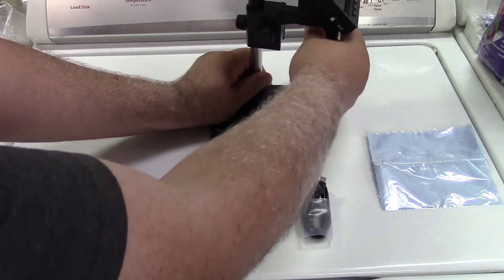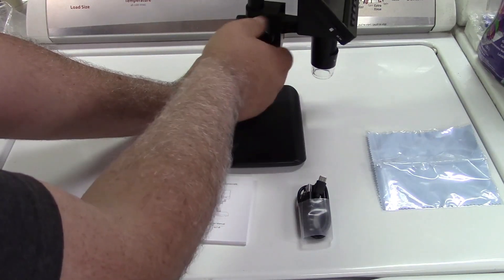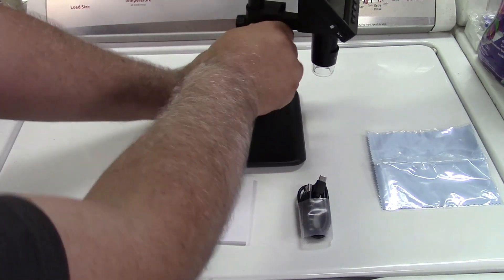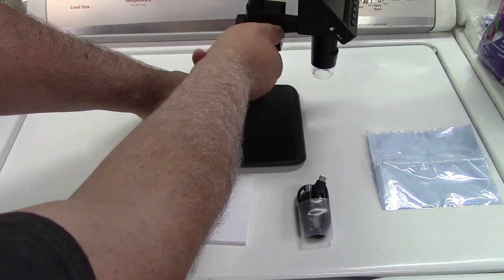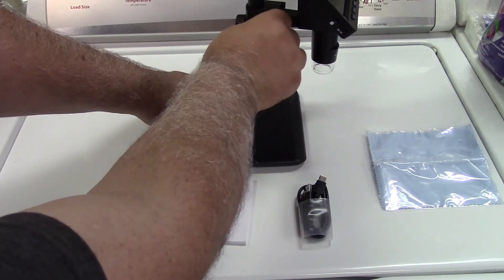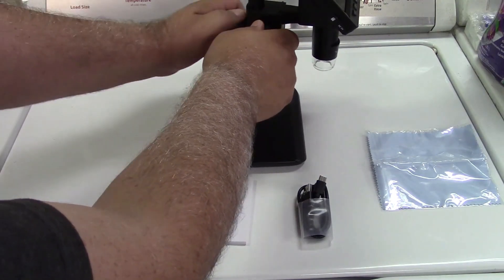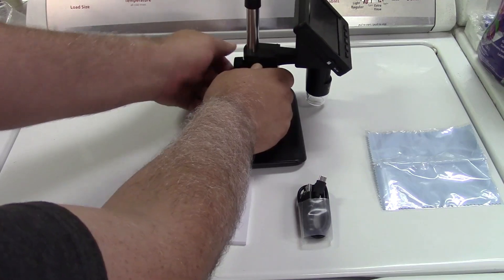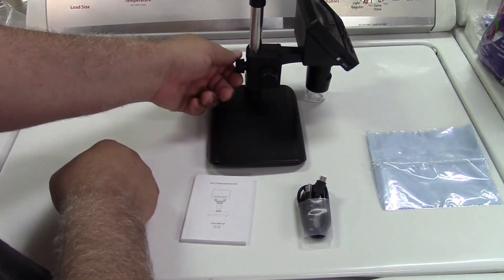The whole thing will turn if you want. And we can use the knobs over here to raise and lower the scope as you see right there. If you want to lower it even closer, you can just loosen the nut on the back right there.